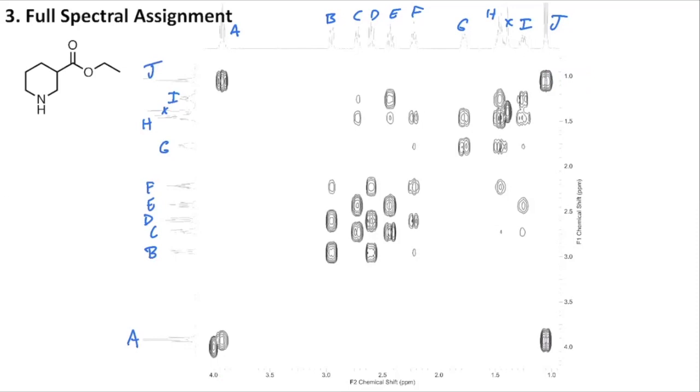All right, with our labels in, let's draw in the identity diagonal. And again, it doesn't exactly look like it goes quite across this box perfectly. So we'll just start down here, draw on a line, and try to line it up as good as we can with the center of these peaks.